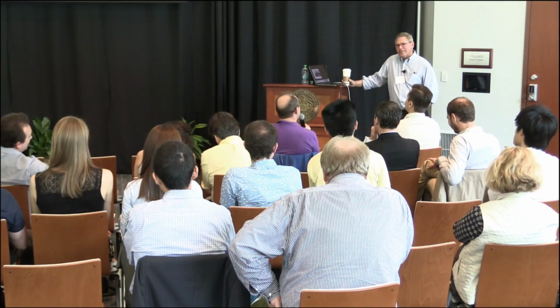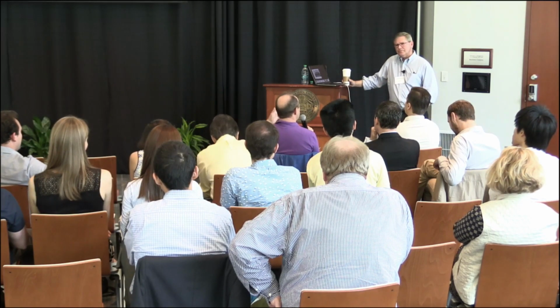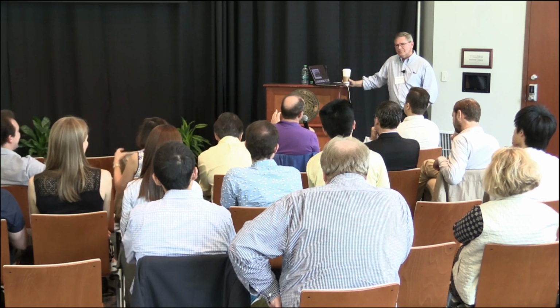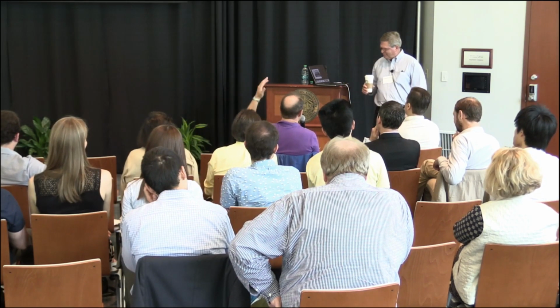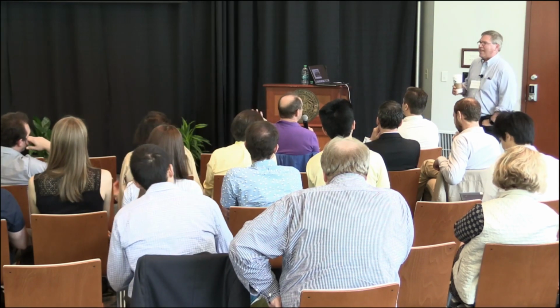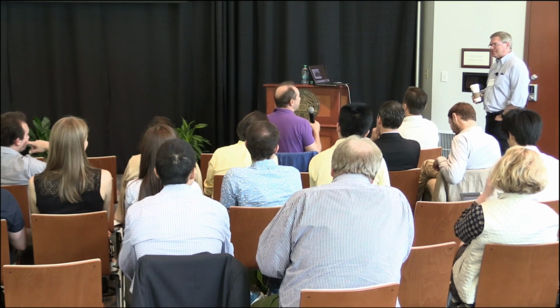John, all coins have two sides, so let me turn the other side of the coin. The development of using the database searches led to the fact that people are no longer looking at these mass spectra, and sometimes they don't even look at the LC-MS runs. So they just get the results of the search, and sometimes you get more protein, sometimes less. What they don't know is whether there is anything else in their LC-MS runs that they have not searched for.